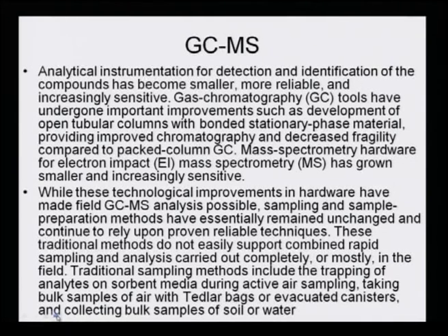Traditional sampling methods include the trapping of analytes on sorbent media during active air sampling, taking bulk samples of air with Tedlar bags or evacuated canisters, and collecting bulk samples of soil and water. Now, one needs to re-evaluate where all the innovations and newness has come and what is still existing as what we had learnt in the past few lectures.